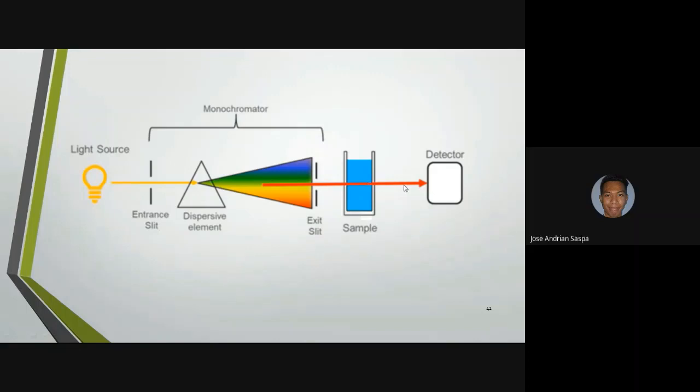The instrument's ability to separate light into defined wavelength regions is known as the spectral resolution. However, since less light will pass through a narrow slit, the spectrum tends to spread out. When the light source strikes the prism, this prism creates a rainbow of colors.